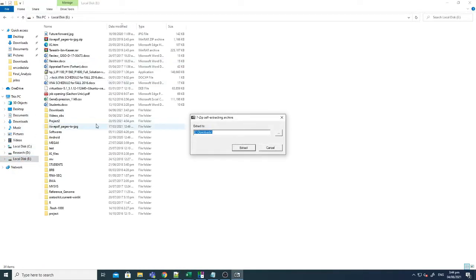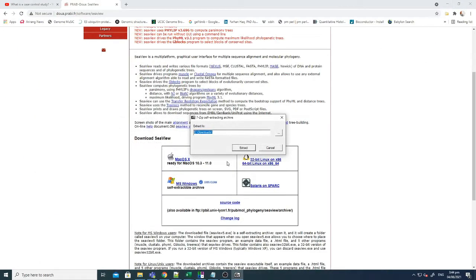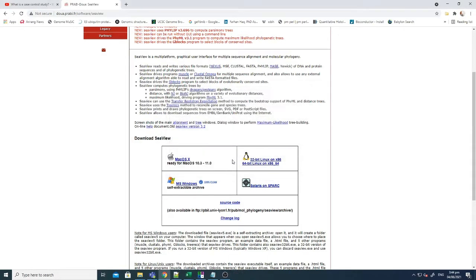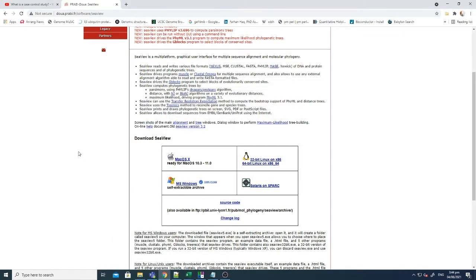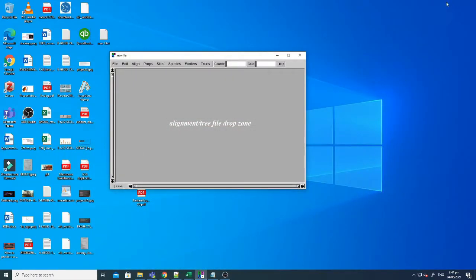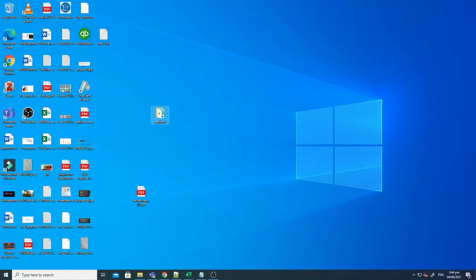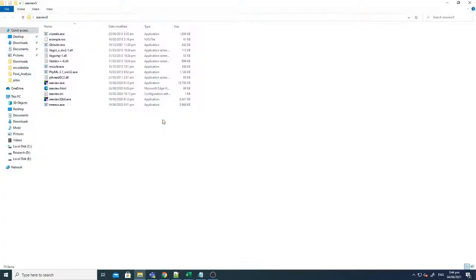So it's downloaded here in the download options. Just open here, just click extract and this will extract the file and the file will contain all the information. You just have to double click the software. So I've already installed it here on the desktop like C view 5.